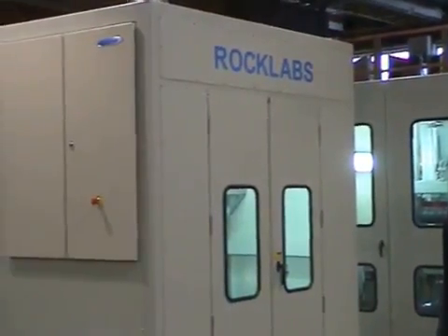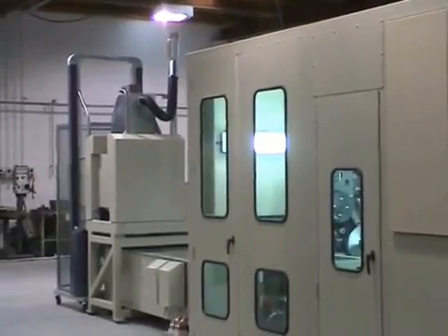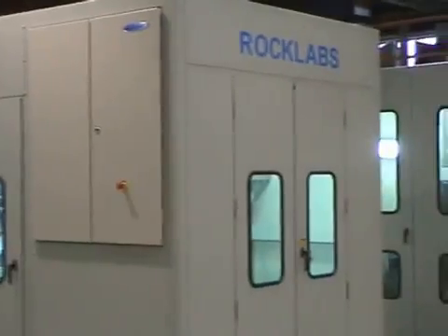In this video we're describing two automated sample prep systems that we've built for GeoAnalytica, a commercial laboratory in Chile. One of the systems is designed to handle drill core and other materials with large lumps, and the one furthest behind me is designed for blast hole samples and RC type samples, and they don't require a big void as a primary crusher.